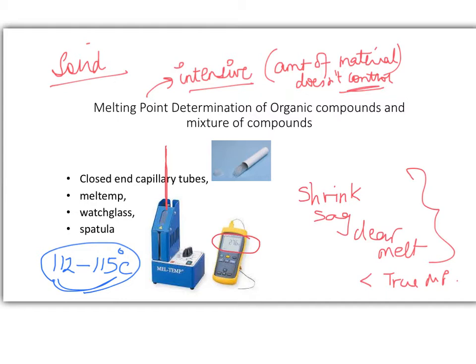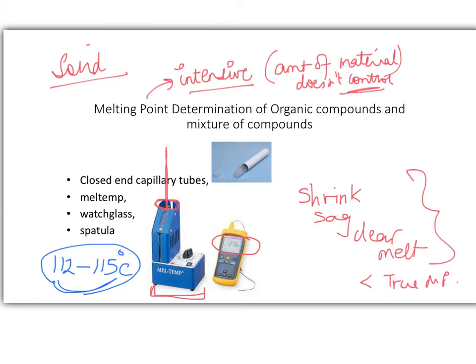Now, I should mention here of course, later on I discuss the instrument in a little bit more detail, but just to get your feet wet, this is a Mel-Temp, which will measure our melting points. Like I said, there is a little aluminum slot right over here. It's an aluminum cylinder-like shape in which we are going to put the analog thermometer. Always a good idea to put the analog thermometer as well as the digital thermometer, just in case the digital thermometer starts to act up.